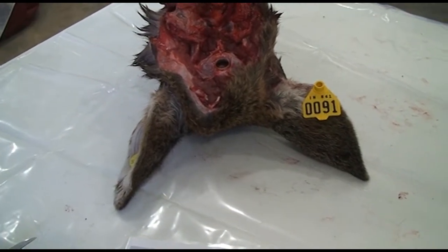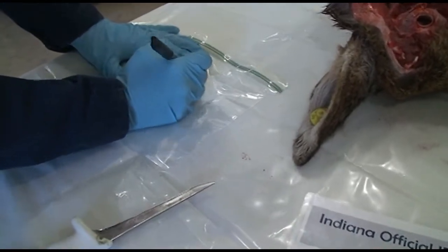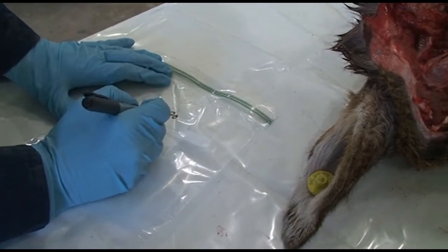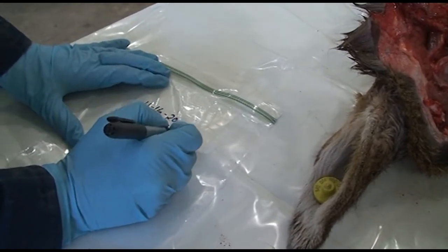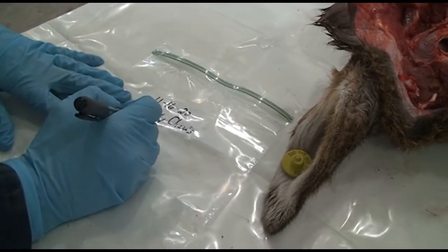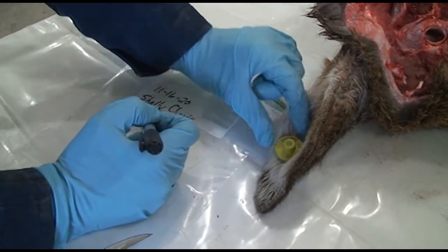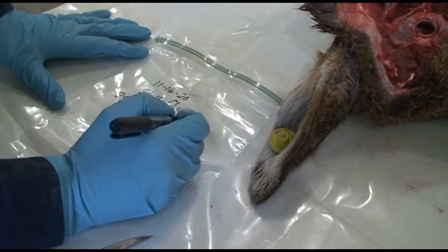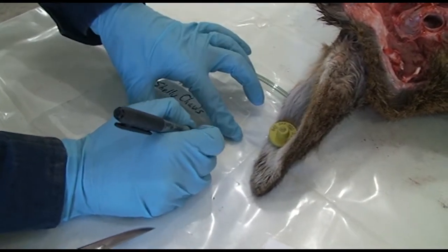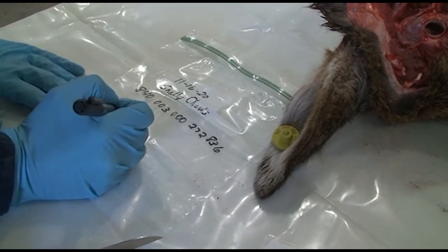its own separate sealable bag. And on the bag, we want to label it with the date that you're collecting the samples. And then the producer's name. So let's use my name. So date, name, and then the ID tags of the animal. And the whole number, 840-003, 000-272, 836. And then if you had a management number with it also, you can put that below the 840 number.